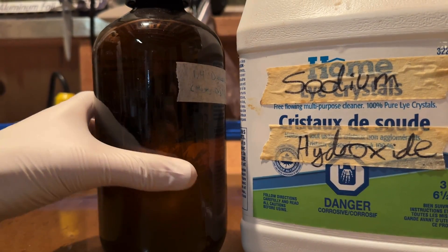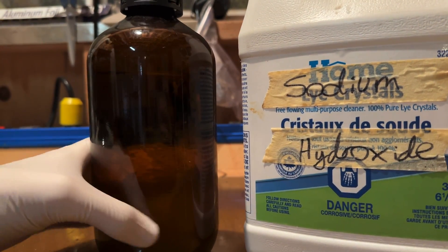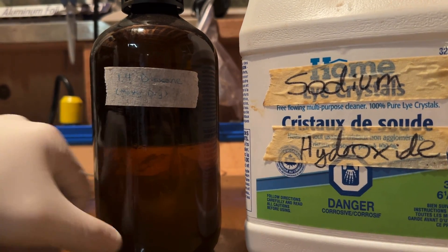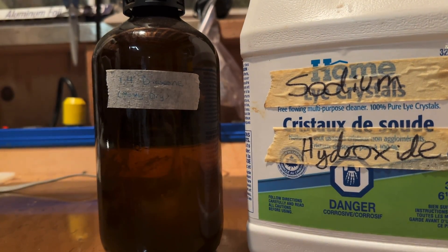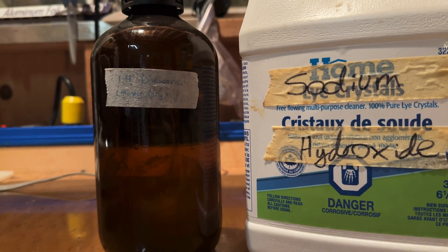As a quick note of caution, ethers can form explosive peroxides upon exposure to light and oxygen. To prevent the formation of explosive peroxides, the dioxane should be stored under some sodium hydroxide and in an amber glass bottle. Additionally, dioxane is carcinogenic, so its use and preparation must be done in a well-ventilated area.